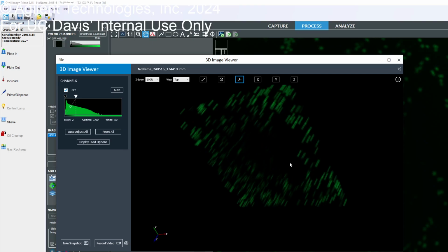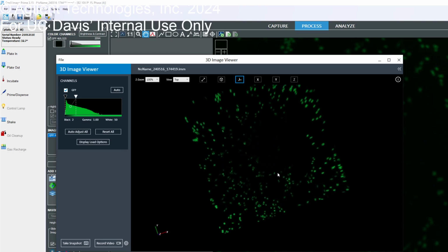But when you have a 3D sample, you'll have some 3D data to look at. So even if the cells are actually 3D because they're cells, right? If you look at the height, those are gonna be like 5 microns, 10 microns, not beyond that. So it's not enough resolution.